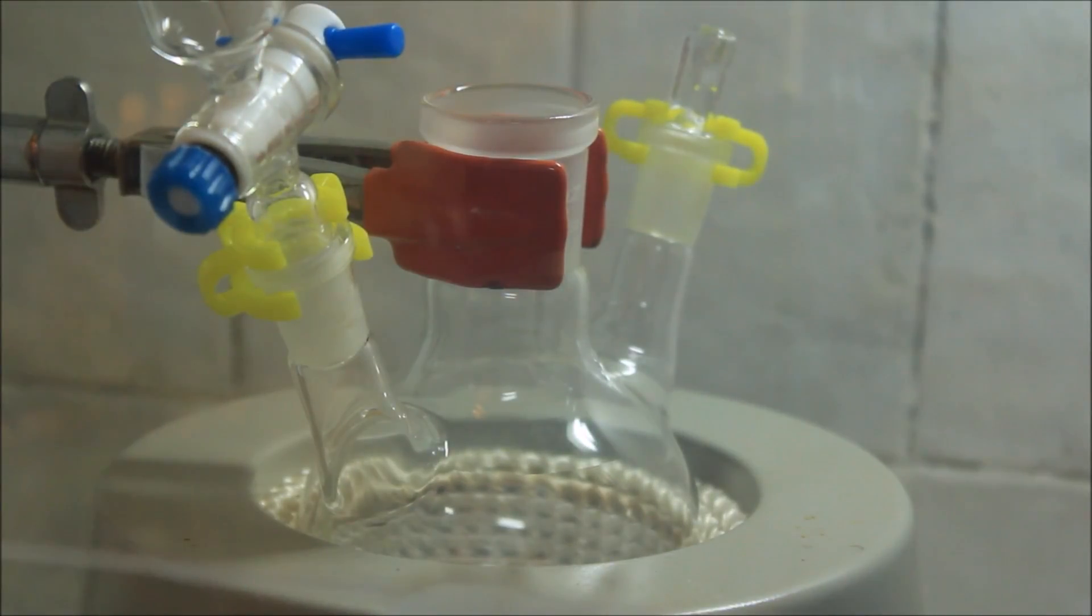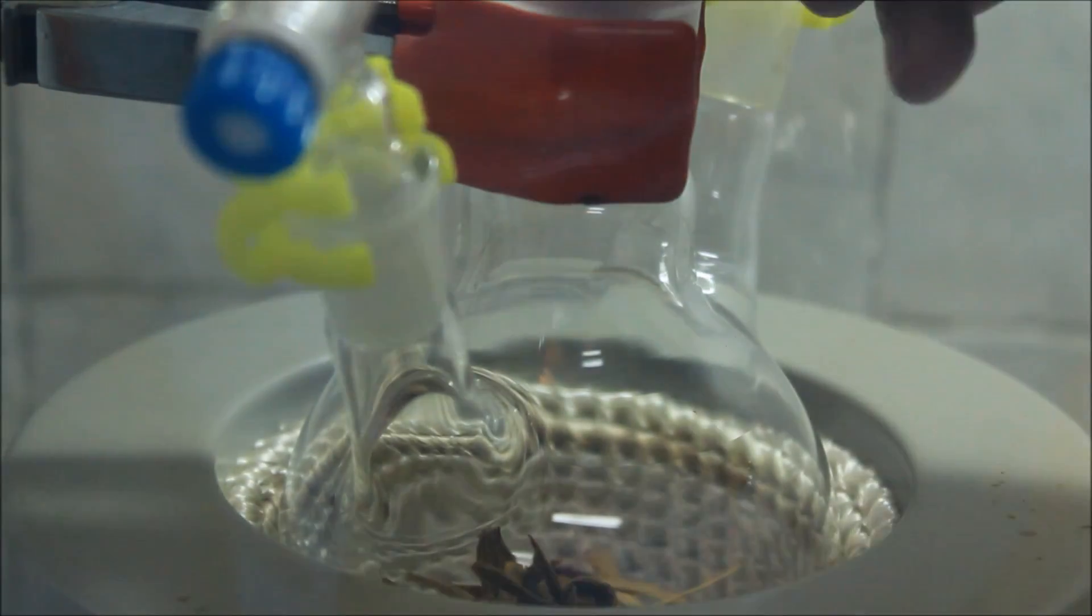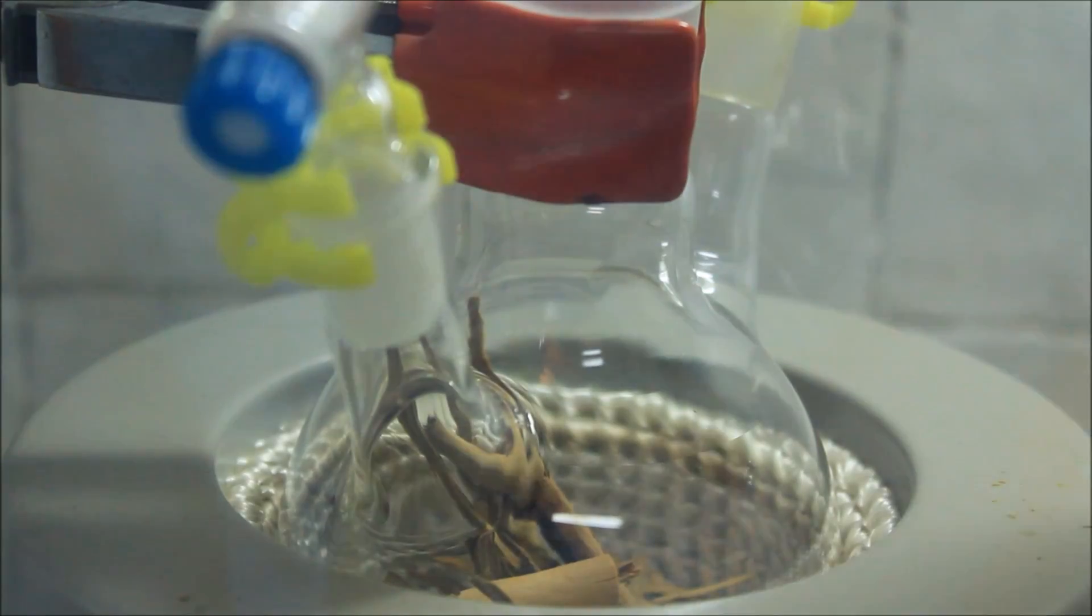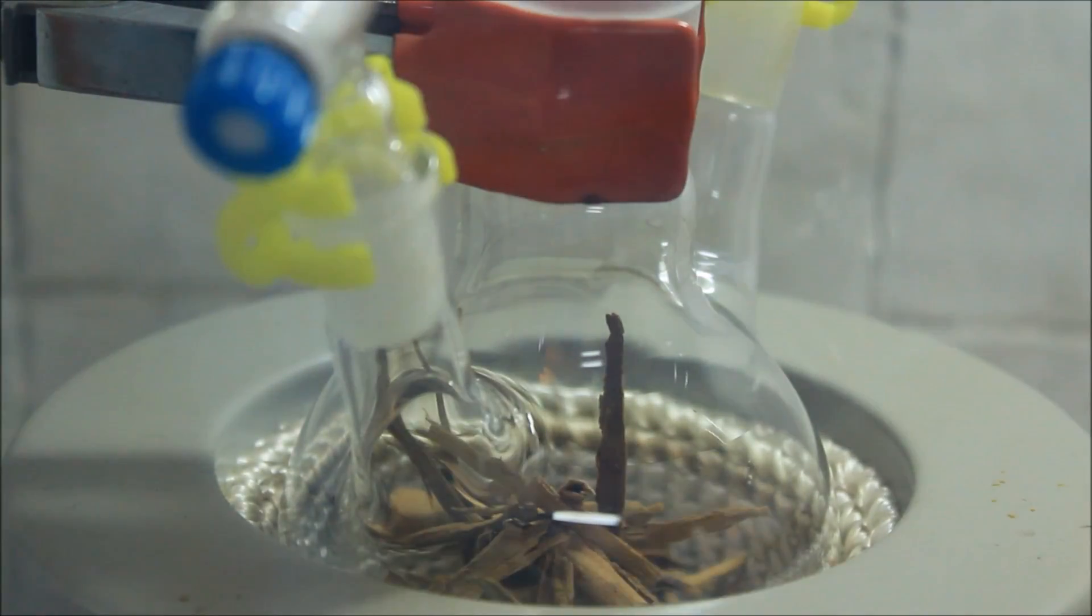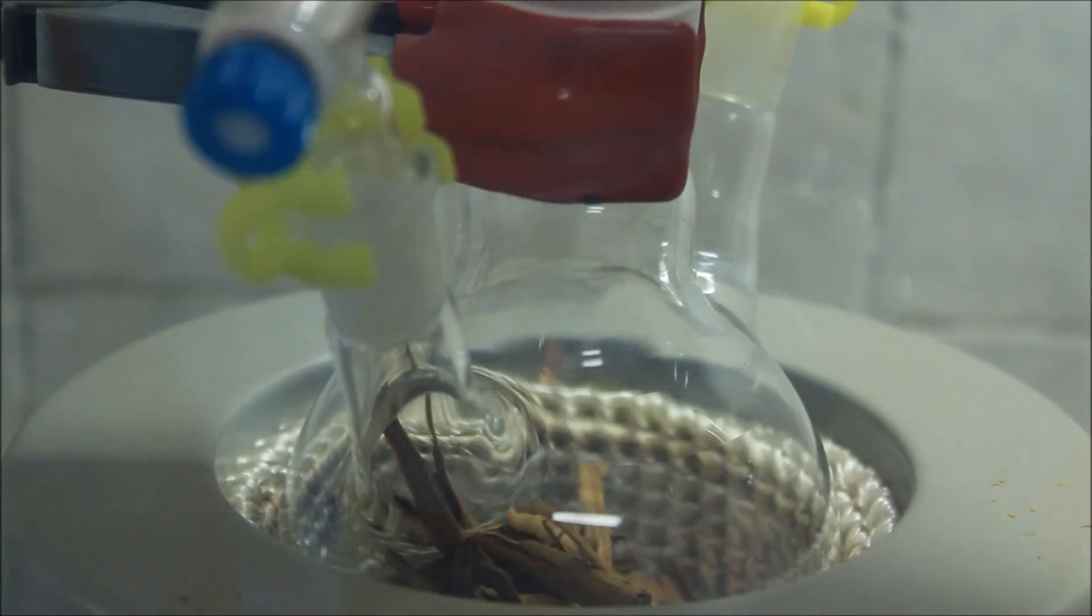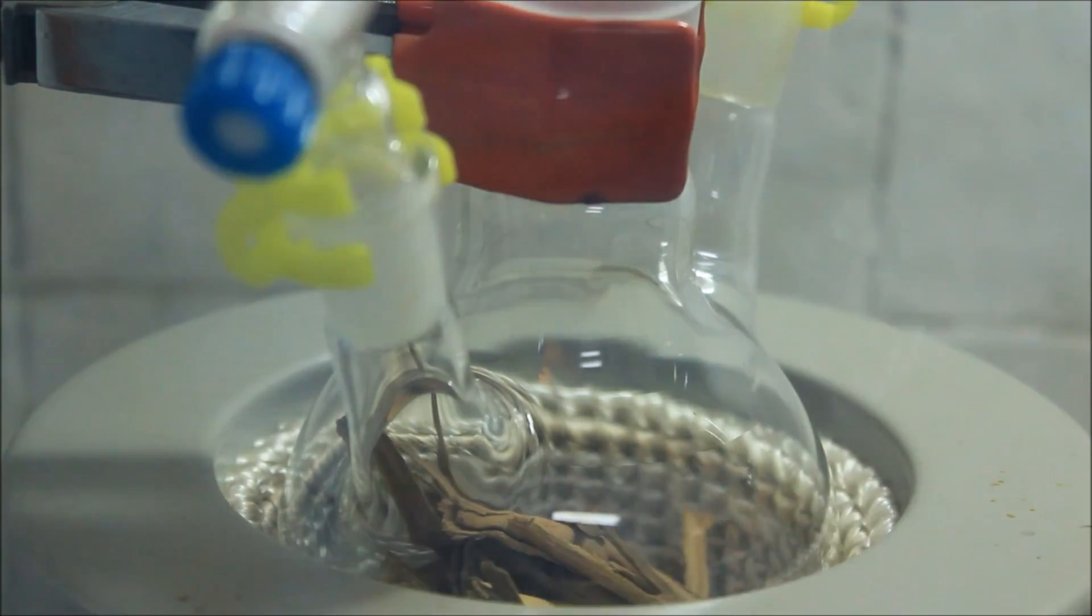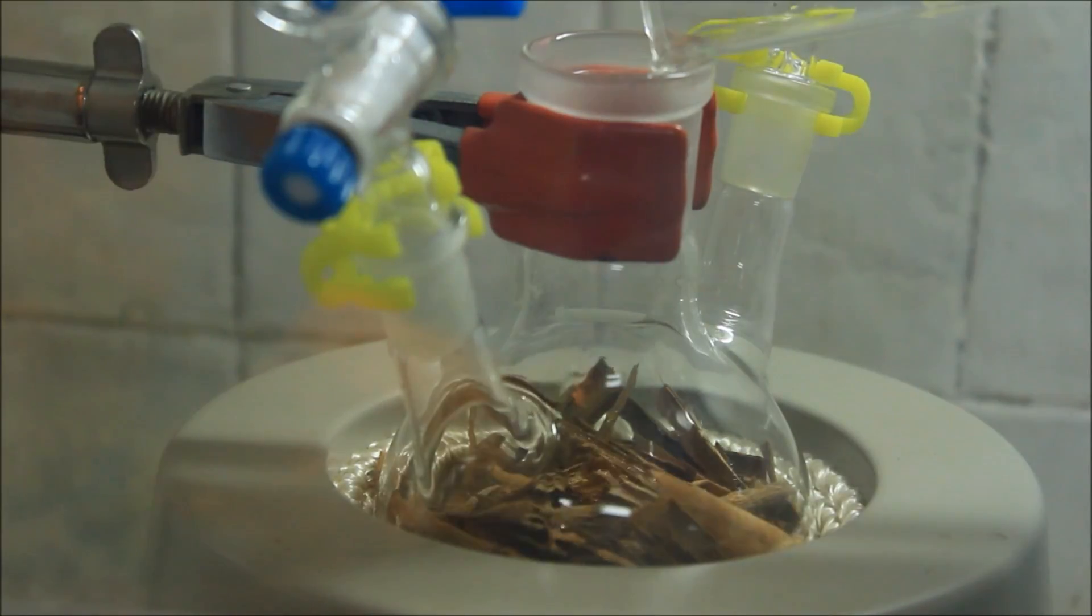Now the cinnamon bark is placed inside a three neck round bottom flask. You could also use a single neck RB flask, but it is better to use a three neck one if you have it, you will see later why. Once all the cinnamon was added, 150 milliliters of distilled water are added to the flask.